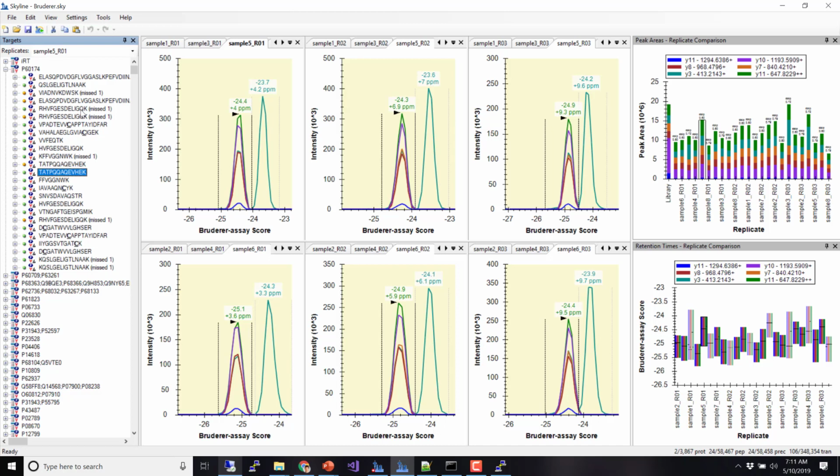If I don't have an assay library, but I have another kind of calculator that also normalizes the times? Yes, you can normalize the retention times to IRT. These are equivalent, right?